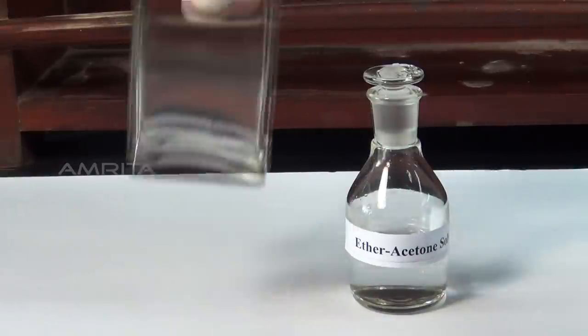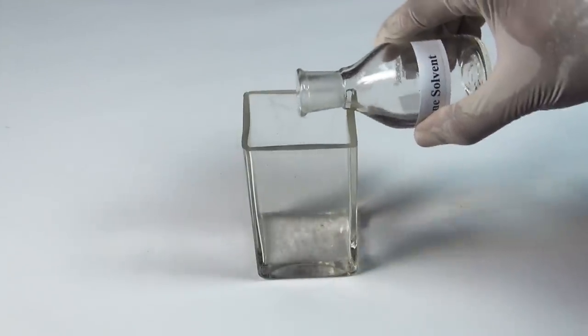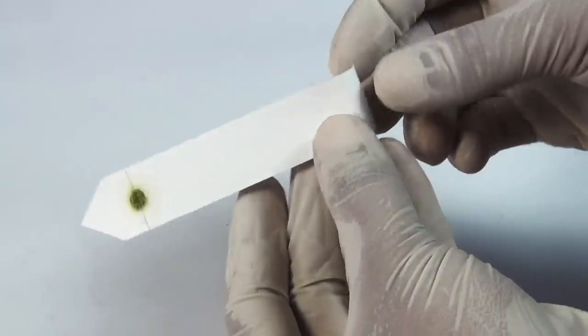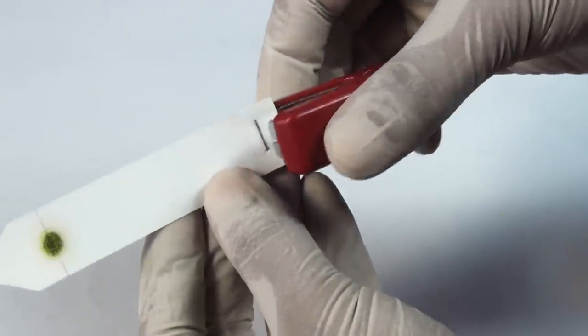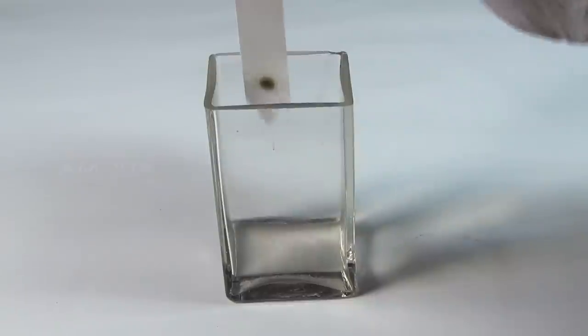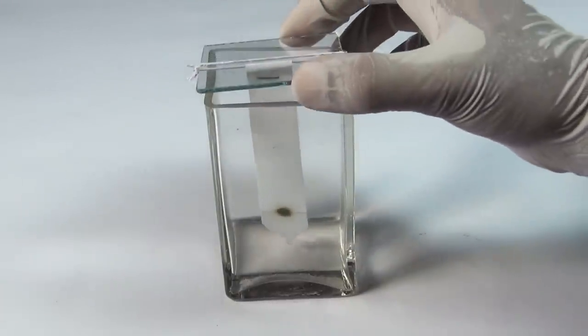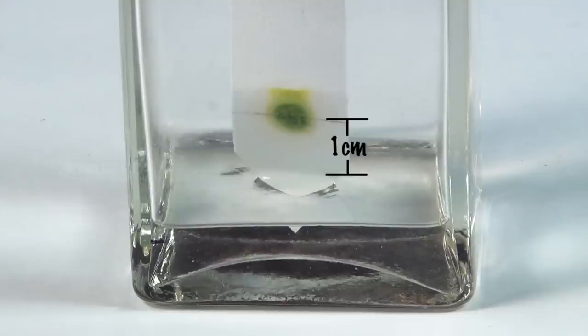Take the chromatographic chamber and pour ether acetone solvent into it. Fold one end of the filter paper strip and staple it. Using a thread, hang the filter paper strip into the chromatographic chamber. The loading spot should remain about 1 cm above the solvent level.